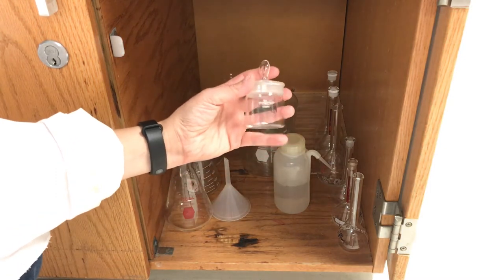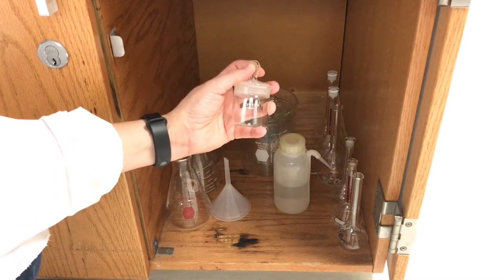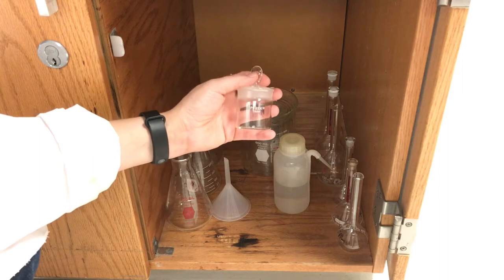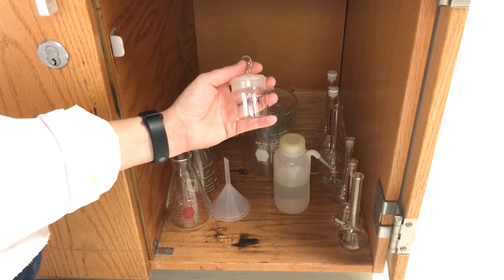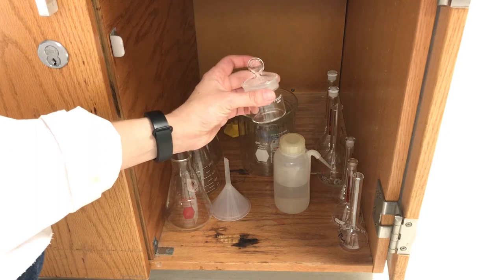This might be something you haven't seen before. This is a weighing bottle. We'll use this to dry different samples and it's also useful when you're weighing to weigh by difference.